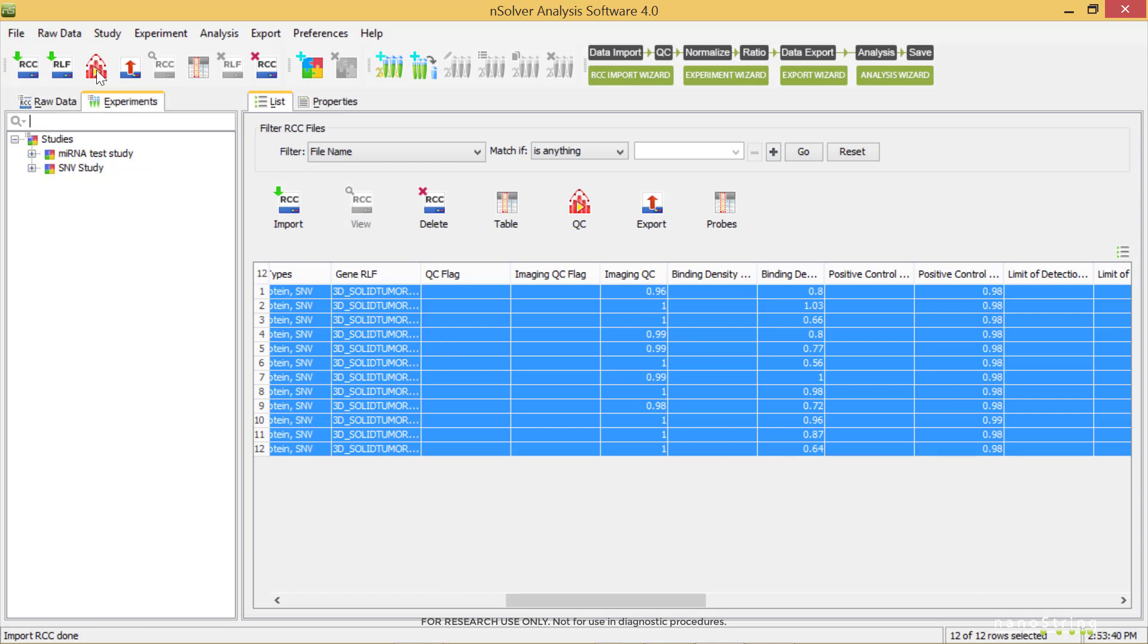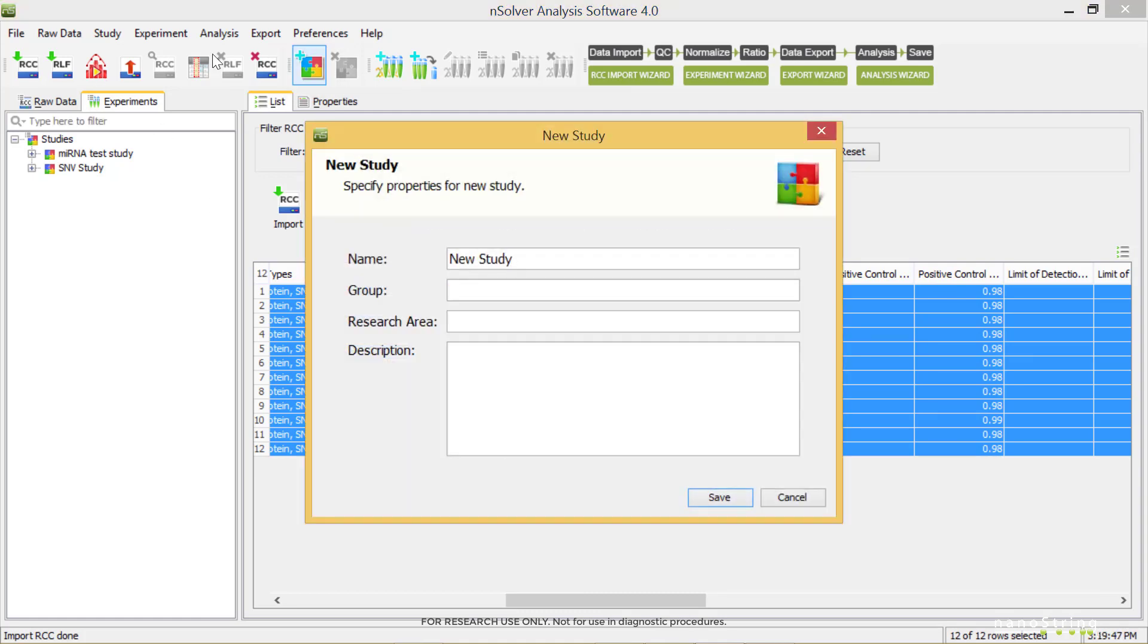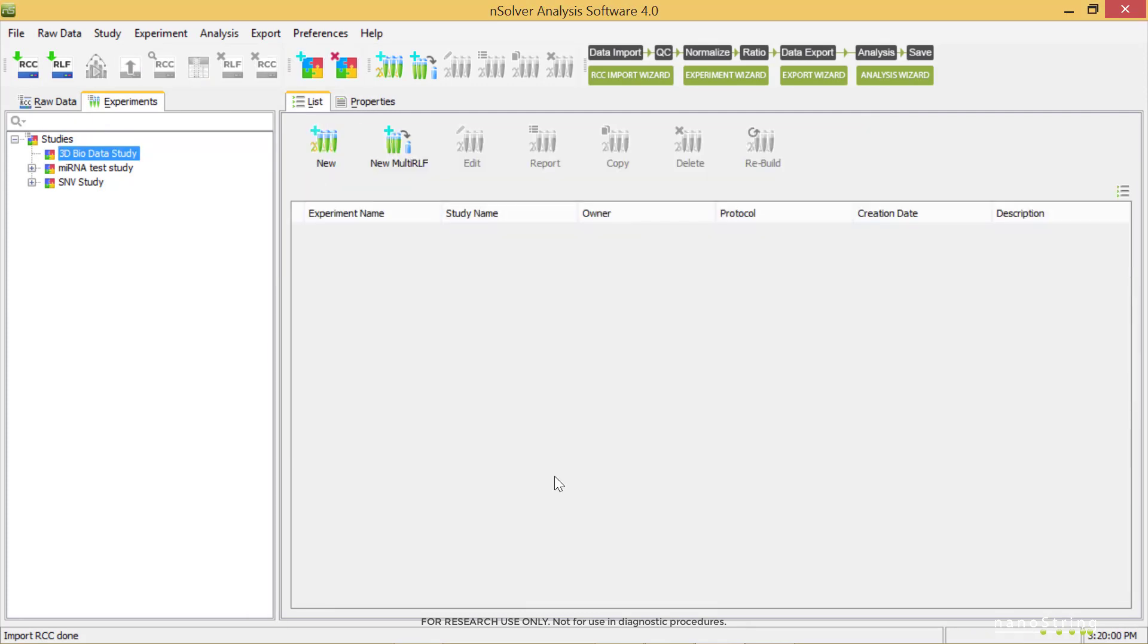Now, let's create an experiment. Select a New Study button from the main dashboard and enter a unique study name. Select Save. We'll find our new study on the Experiments tab, and we can highlight it.